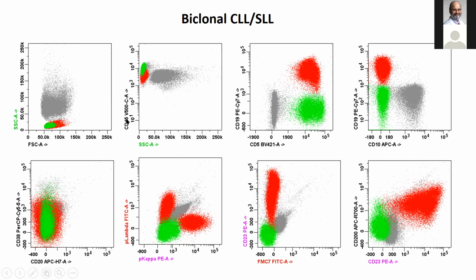They are hematolymphoid. They've got slightly dimmer expression of CD45 compared to the T cells. We can see that they're B-lineage cells because they're CD19 positive. They've got CD23 and they have surface immunoglobulin. Again, we use surface immunoglobulin to identify abnormal populations of B cells. If you look at this population, it looks like a polytypic population of B cells. Now, I know these are neoplastic because I did the entire analysis, but we don't have any normal B cells in this case as a reference population.